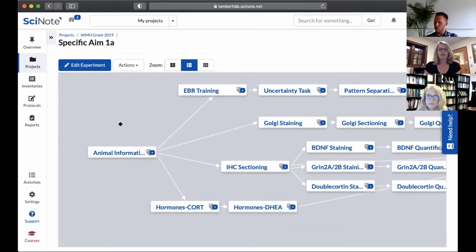And let me just scale down for a second so you guys can actually see this. When we're creating our web, one of the things that we spent a lot of time working through and customizing for our needs was the fact that we didn't have streamlined, more linear processes, where you start with a single step, something like a qPCR experiment or a Western blot or an ELISA, where there's clearly a step 1, 2, 3, 4, etc. You'll notice, if you're a user of SciNote, that a lot of the demos, fairly so, for clarity, are very linear processes with these webs.